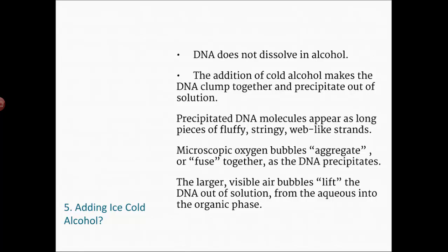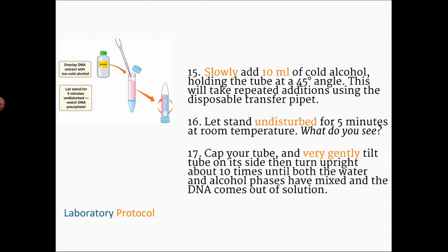DNA doesn't dissolve in alcohol — it does dissolve in water, and your cells are mostly water — but in alcohol it tends to clump together. We use cold alcohol so the molecules slow down and stick together and precipitate. It'll look like little strands of fluffy cotton or a spider-web. You'll also see some tiny bubbles that help bring the DNA up toward the top of the tube. Once you've incubated for 10 minutes, slowly add about 10 milliliters of cold alcohol, holding the tube at a 45-degree angle to layer it on top.